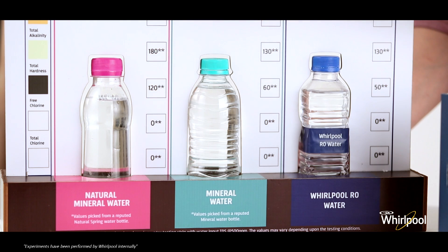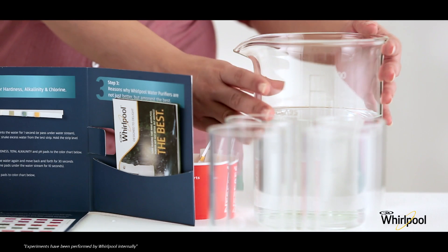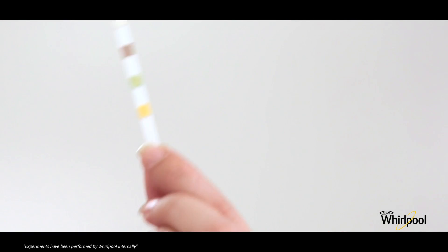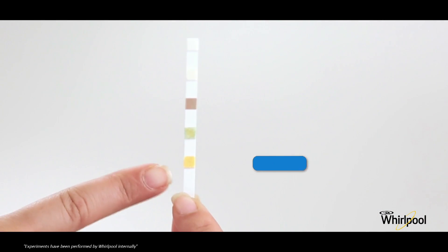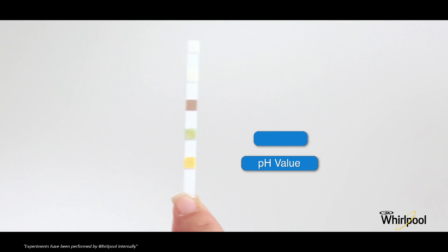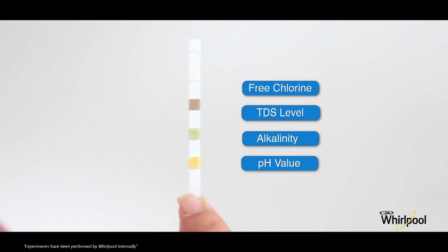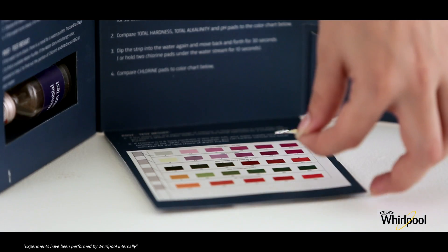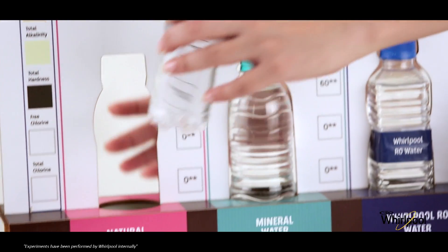Now let's start the test. We have four sources of water: natural spring water, bottled water, Whirlpool RO water, and normal tap water. For the test, we have testing strips with different color codes indicating pH value, total alkalinity, total hardness, free chlorine, and total chlorine. We also have a testing measurement sheet to help measure the readings.